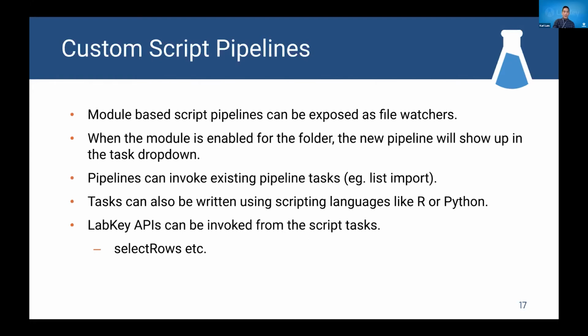Okay, so custom script pipelines, I mentioned this earlier. We've had script pipelines, module-based pipelines, for a while here. In the 20.7 release, we allowed the ability to expose these as file watchers. And so if the module is enabled, you'll see your file watcher task appear in the dropdown.